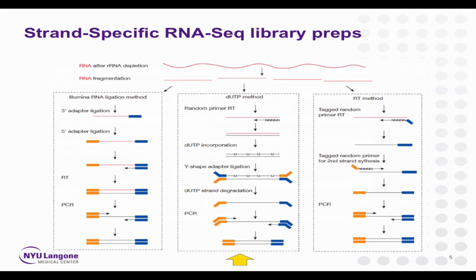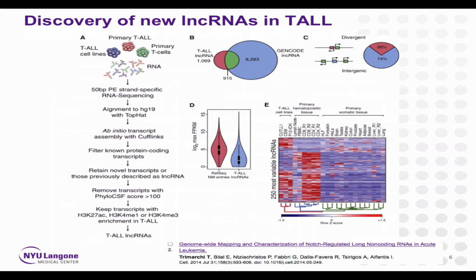It's a little bit more expensive because of the RNA depletion. However, there's a method to do strand-specific RNA-seq using the PolyA tail, and that's actually just as expensive or just as cheap as the original one. So we have basically switched all our preps to strand-specific unless we are just accumulating samples for a very old project, because you get additional information and it's for the same money. So we are doing all of our preps in a strand-specific fashion nowadays.